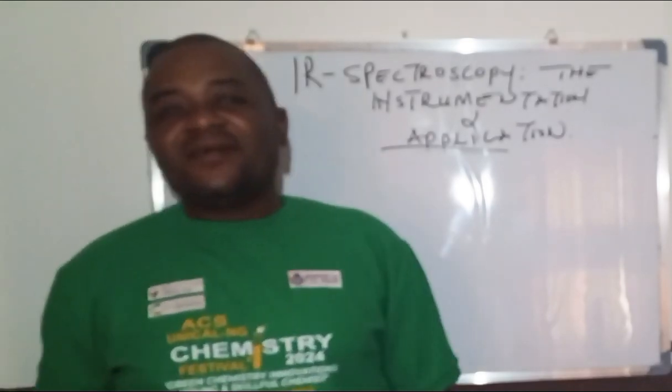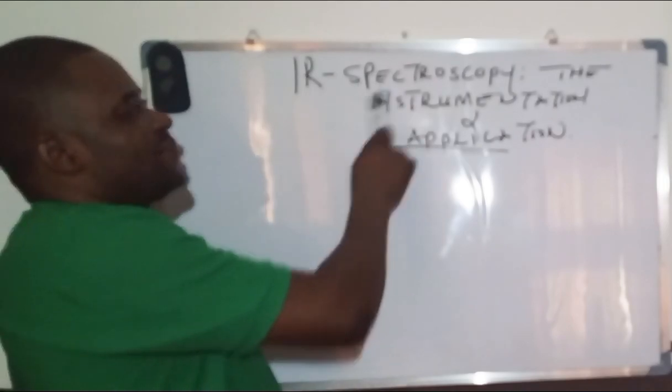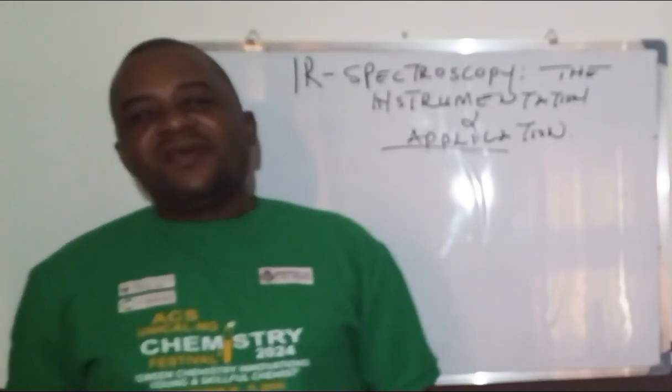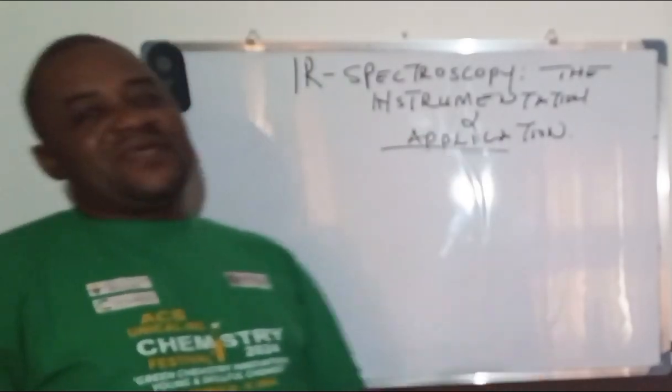We had already dealt with the principle of infrared spectroscopy in our previous classes, and we had promised ourselves that we're going to take a look at the instrumentation and application.